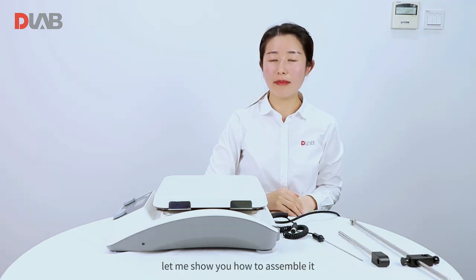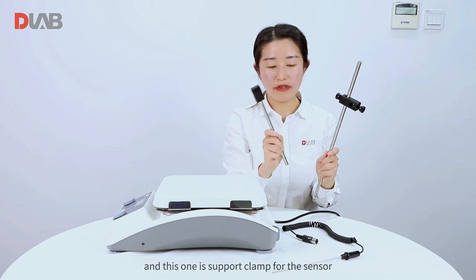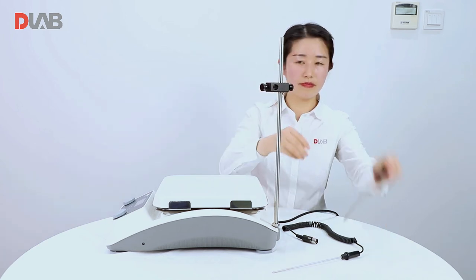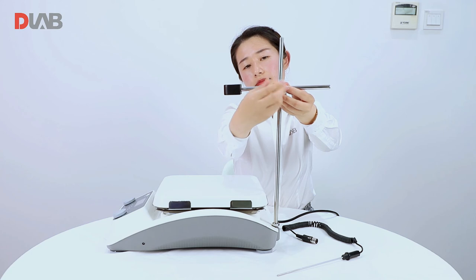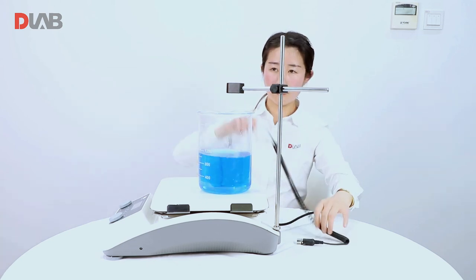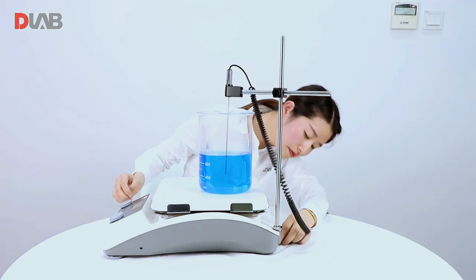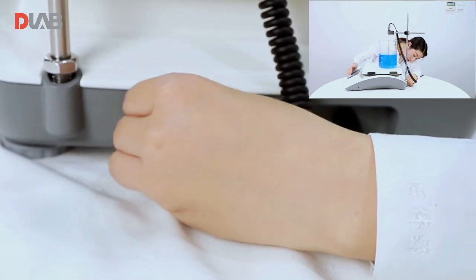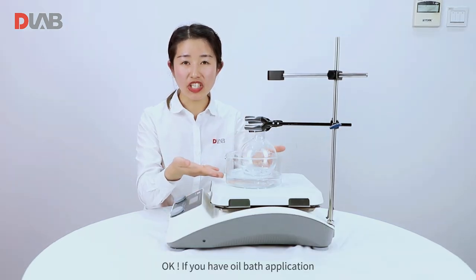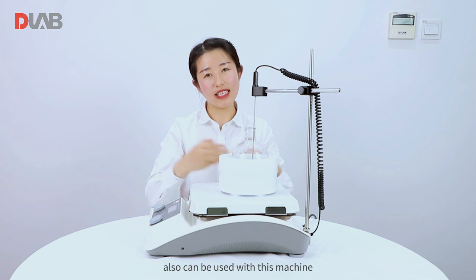Now let me show you how to assemble it. This one is the PT1000 temperature sensor and this one is the support clamp for the sensor. If you have an oil bath application, then you can assemble it like this. Our innovative alloy bead baths can also be used with this machine.